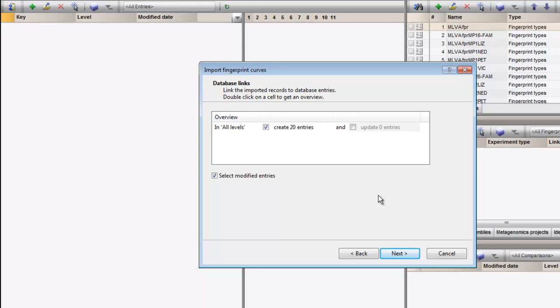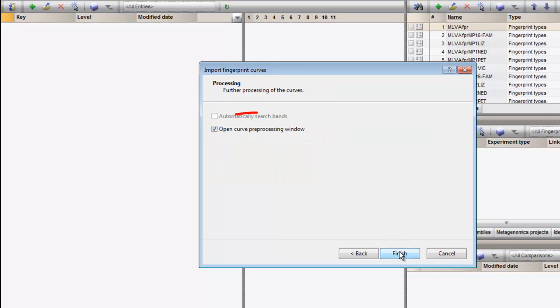The plugin checks if the keys are already present in the database. If not, new entries are created. Enabling this checkbox will automatically open the imported data in the preprocessing window.